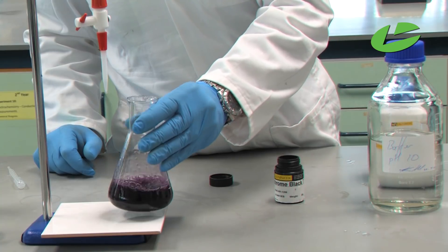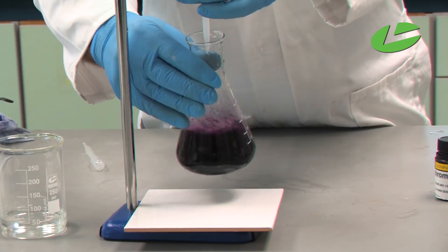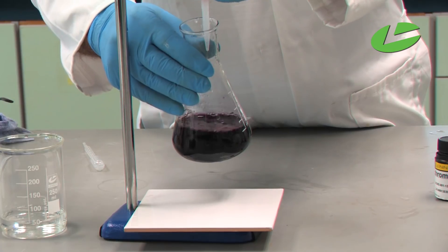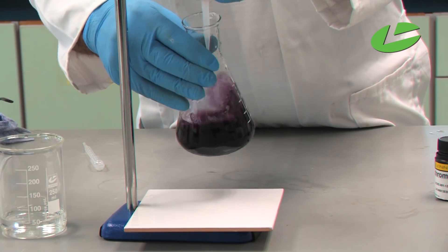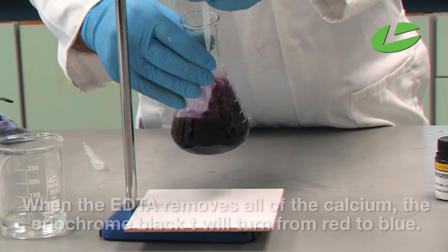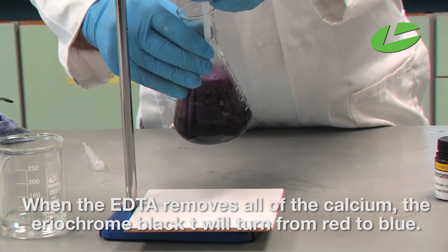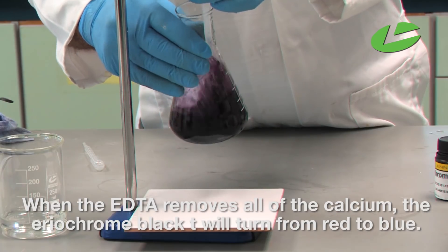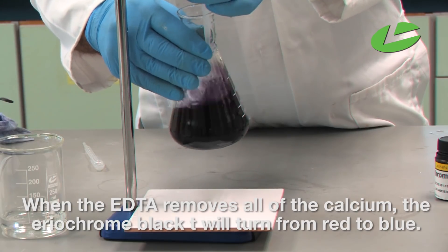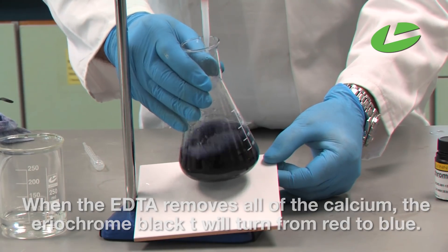We're now ready to start the titration. As we titrate, the wine-red color represents the complex of eriochrome black T with calcium. As I add the EDTA solution while swirling, the EDTA picks up the calcium from the eriochrome black T complex. When all the calcium has been taken by the EDTA, the eriochrome black T will turn a different color — you should notice it has now turned blue.